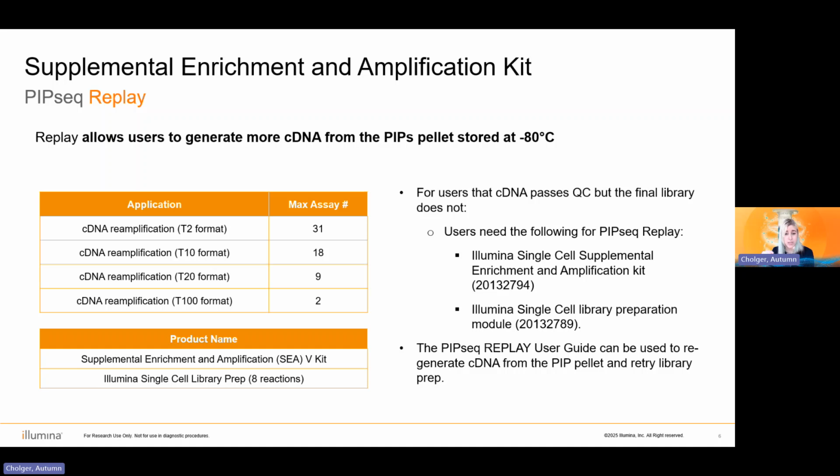And the PipSeq replay user guide is currently only available through your support staff members. So reach out to your FAS, your tech support hotline. We will be the ones that will be able to get you the replay user guide at this time until it's up on the website.